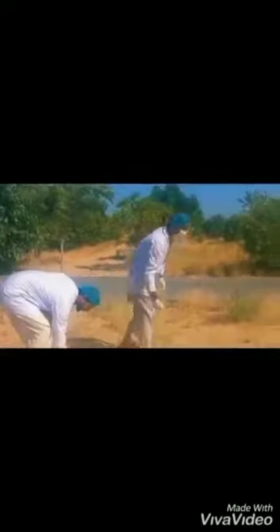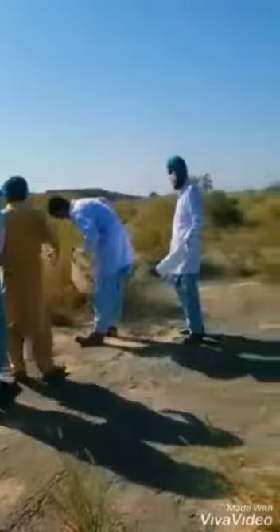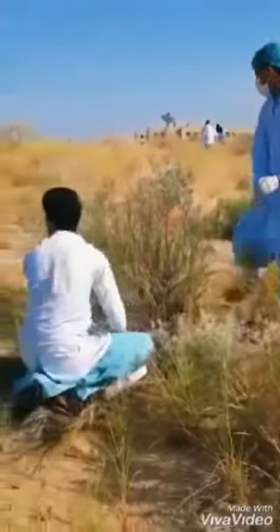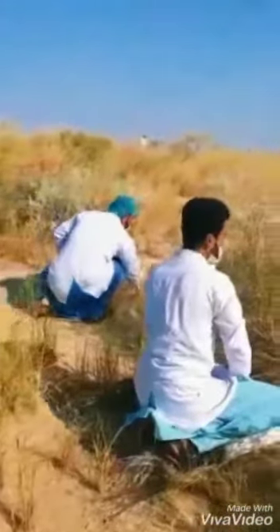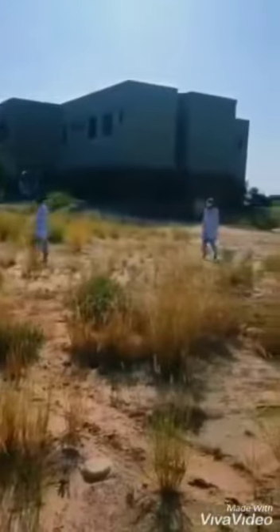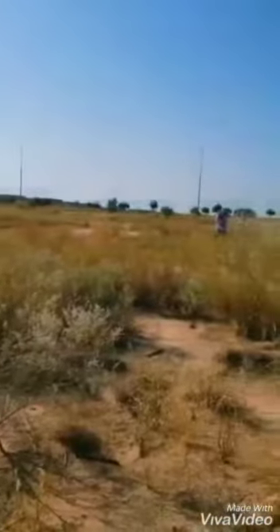Before starting the dissection, all the members of this group worked in the fields for hours, spending much of their time on the collection of scorpions. Finally, they were able to encounter a scorpion and captured it. Later on, that scorpion was brought to the lab where the dissection was performed.